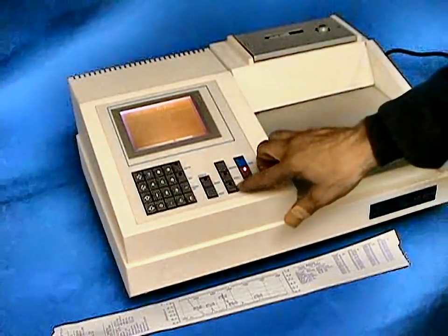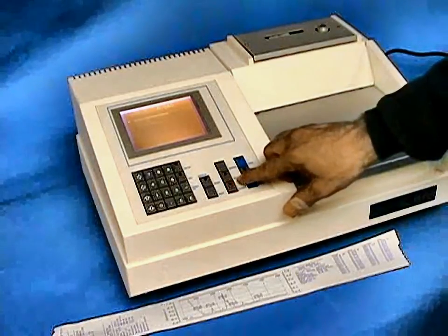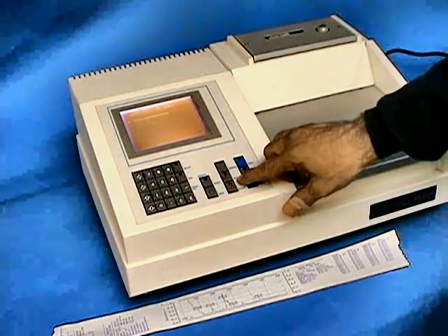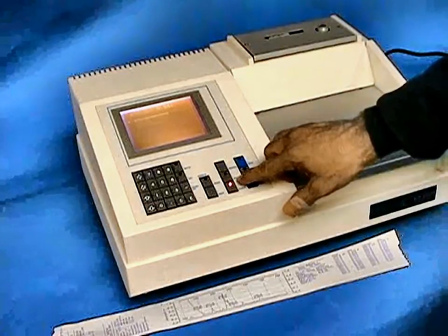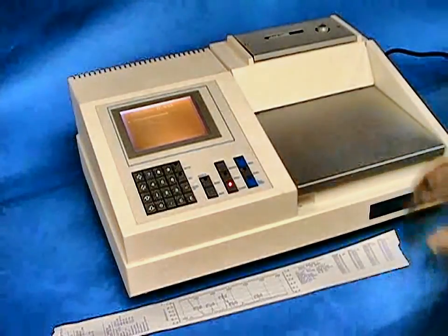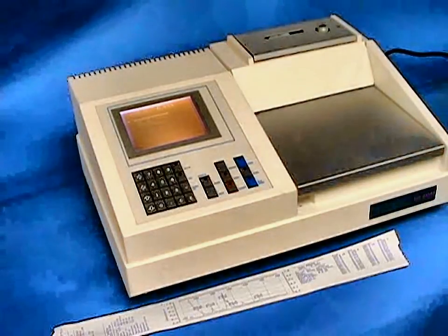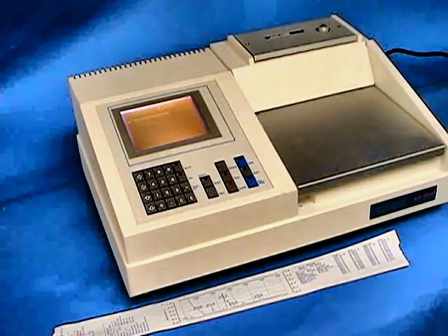The internal software accessible through the quantitative analysis and program keys will allow you to do curve fitting with multiple-point calibration in first, second, and third order curve fits. For its compact size, the CECIL range of spectrophotometers provides capabilities for virtually any application and testing requirement.